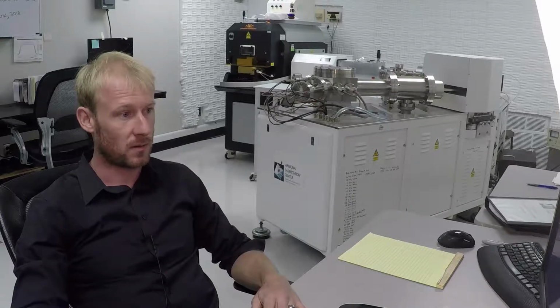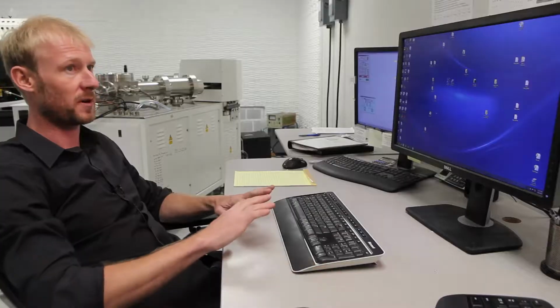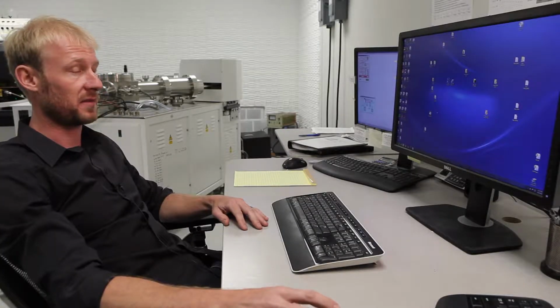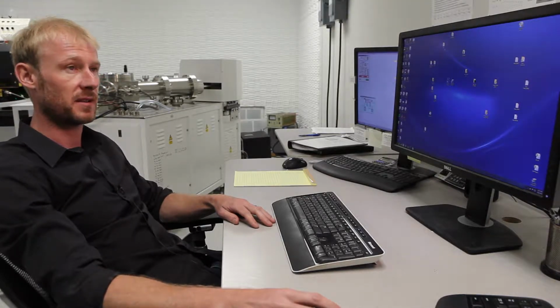This is a video on how to reduce your data using the MATLAB-based data reduction program for hafnium analysis for the new mass spectrometer. Before we do any data reduction, what we need to do is create a folder and put all of our raw data into that folder and the corresponding age file that goes with it. So what I've already done is I've created a folder on the desktop of the lab computer here, and I've placed all of my raw data files into that folder.